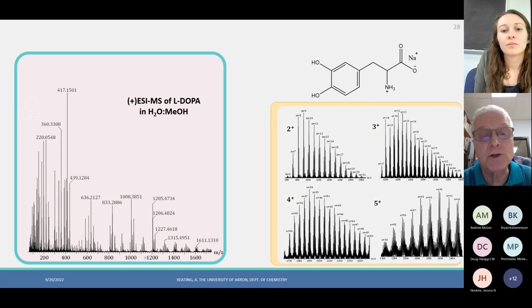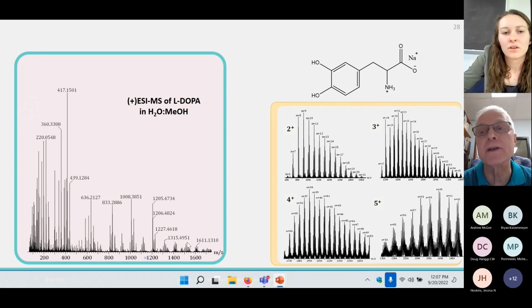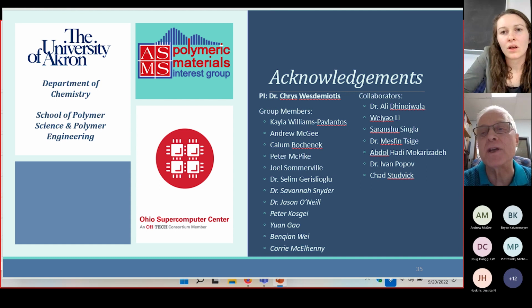I have a question because I learned a little bit from Addie's talk myself. Would that deconvolution method help in giving molecular weight distributions of individual components in mixtures? Let's say if you have a blend of polymers, because if you do GPC, you get the whole thing. I'm trying to find out whether there is an advantage.